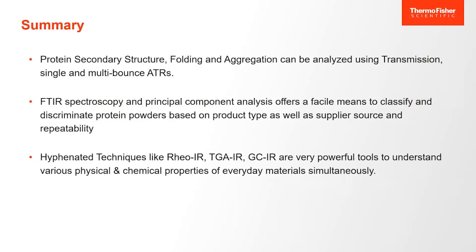We also learned that we can use the power of FTIR spectroscopy and combine it with PCA analysis to create some really powerful discriminate models to do some nice QC techniques. We can also use the hyphenated techniques like the Rheo-IR, which we just did, as well as other things like the TGA-IR or GC-IR to understand various physical and chemical properties of everyday materials.